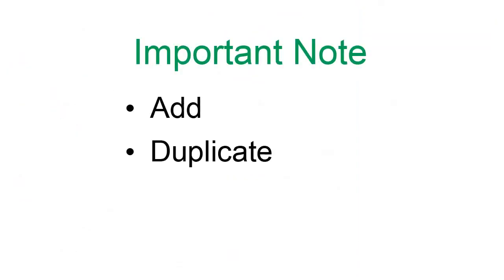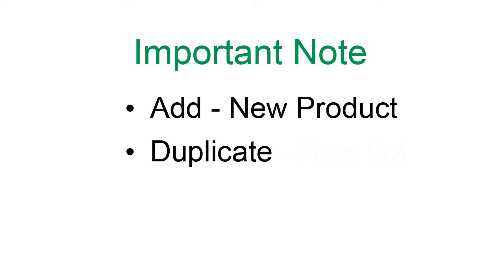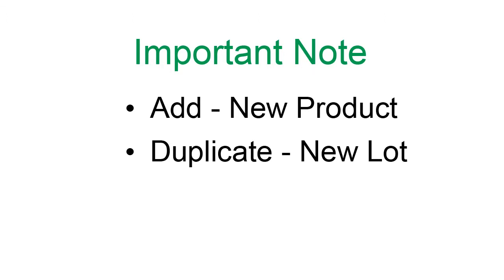There are two ways to manually set up a lot: Adding and duplicating. Adding should be used for totally new control products. Duplication is helpful when switching to a new lot number of an existing control.